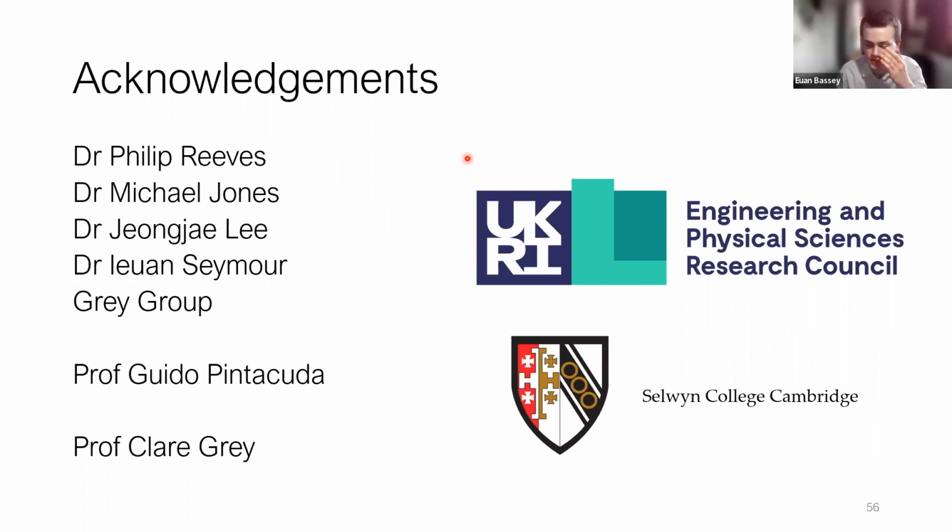It's a good question. I wasn't massively clear. The nice part about the honeycomb ordering is that all of those P2D sites are locally identical. The number of nearest and next nearest neighbors are the same, so the shift should be exactly the same. So those different regions are actually in different parts of the sample. On what sort of length scale is that? It's typically only a few angstroms. If you hop 3 times, it would be about 5-7 angstroms, somewhere between those. Okay.